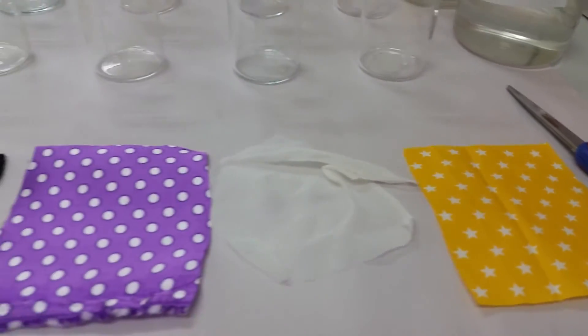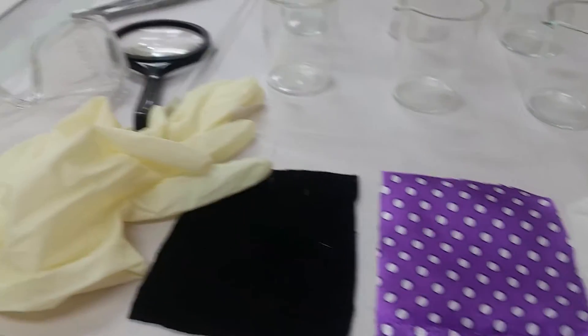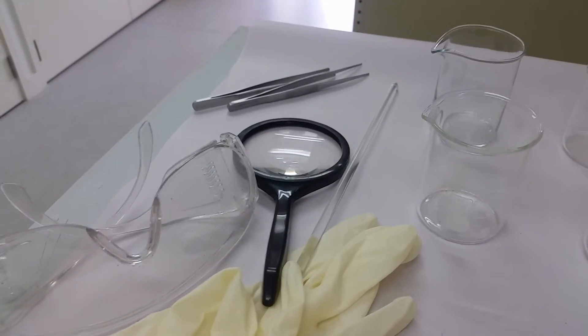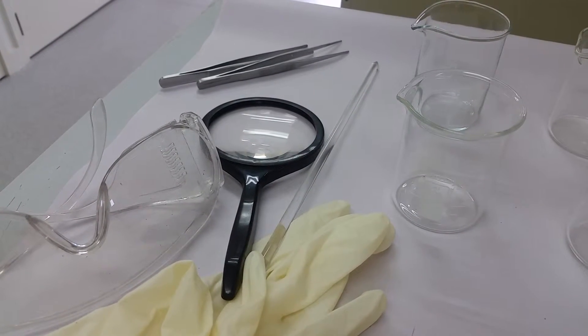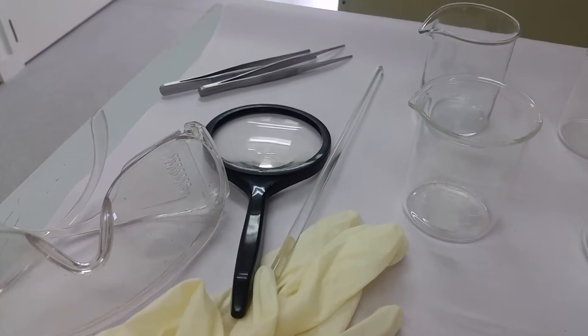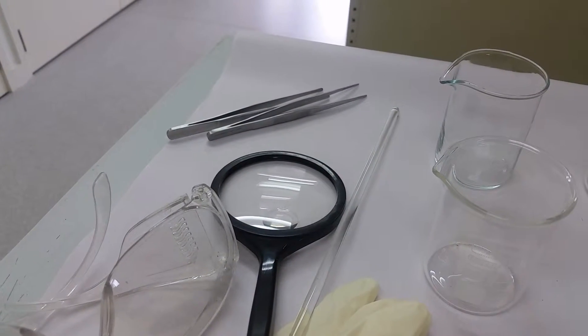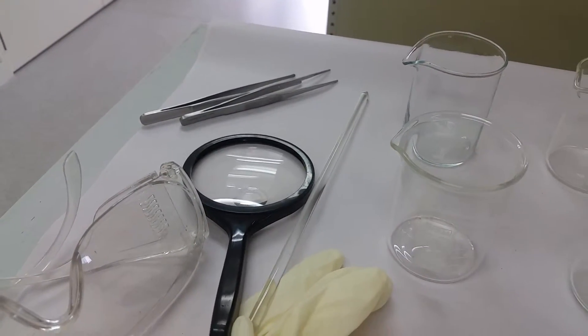I've got some gloves and eye protection, a hand lens or magnifier to check what's going to happen, and there is a glass stirring rod. I've got two forceps so that I can manipulate the materials.